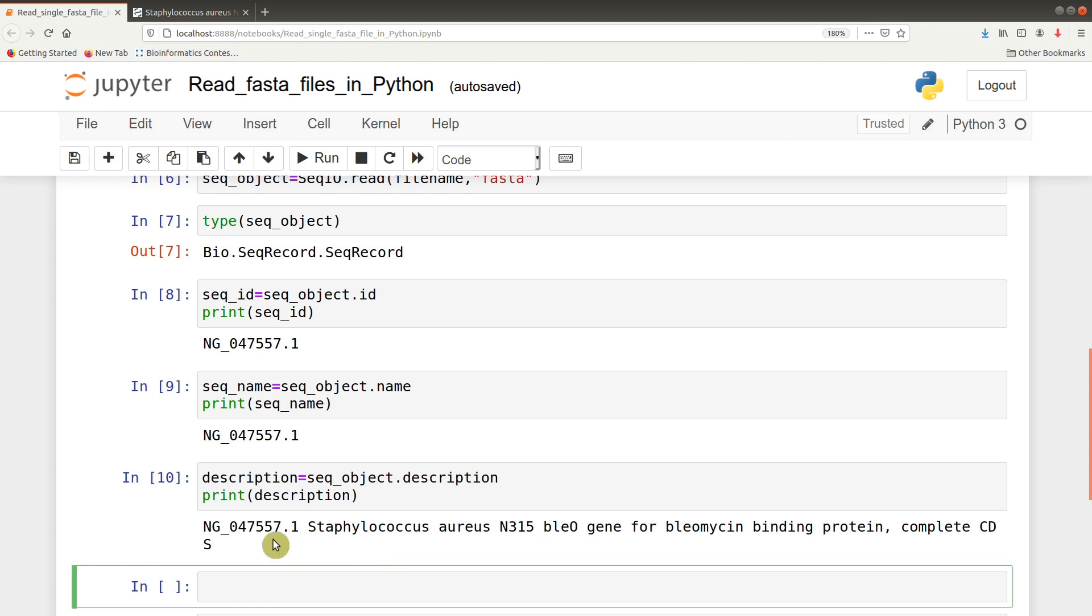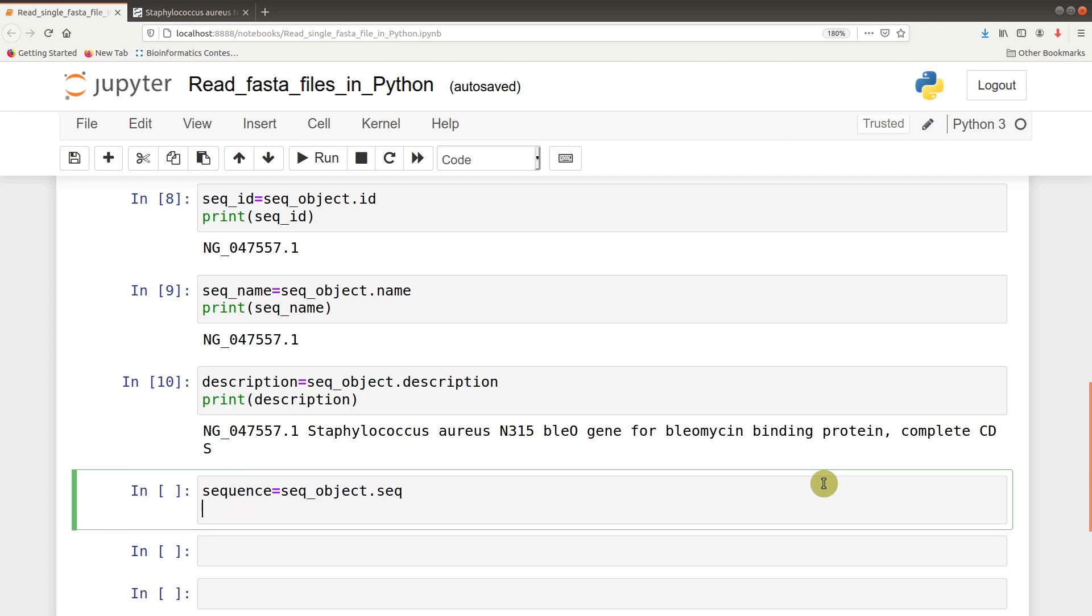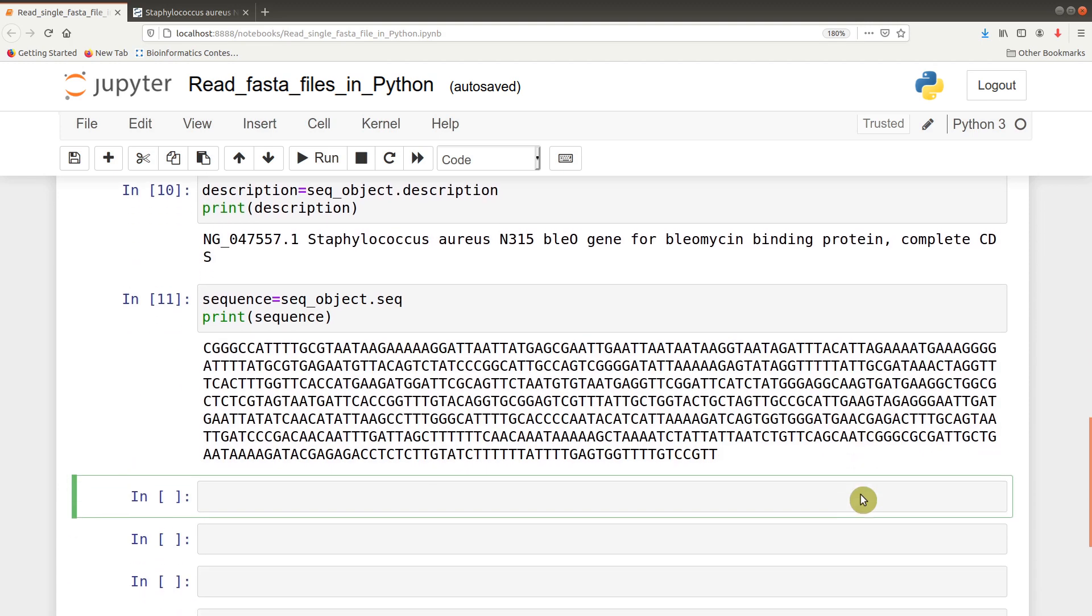You can also do various analyses on it. We can find the length, how many nucleotides are there, but first we need to extract the sequence. You can say sequence equals seq_object.seq, that will give us the sequence. You can print the sequence.